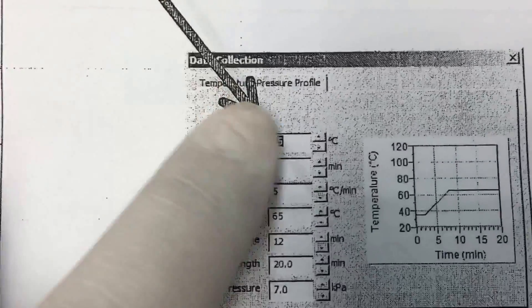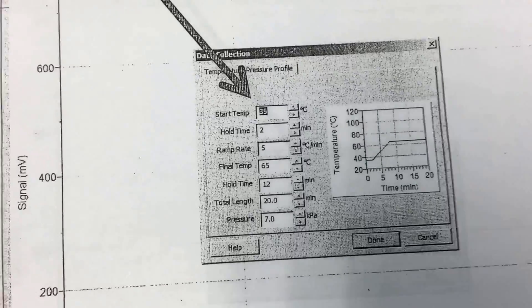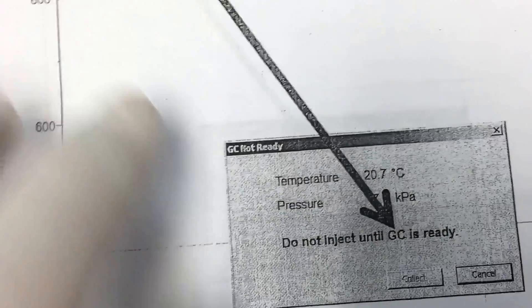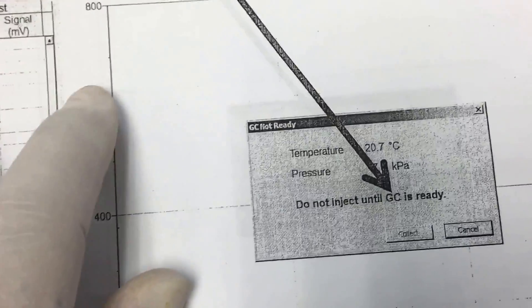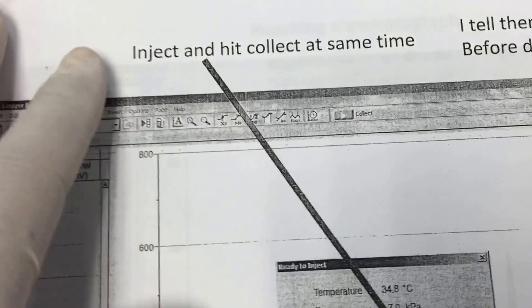In this case I might put it in at 35 degrees and so on. Then the next step is just to wait until it says it's ready — once it prompts ready, you proceed.